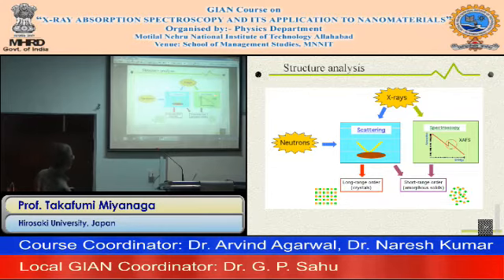On the other hand, in the case of X-ray absorption, I will show you more details later. The very short photoelectron mean free path is important, so short-range order is enough in the solid. So amorphous solids, liquid states, or nanoparticles are very effective for X-ray measurement. Neutrons are also used, by the neutron diffraction method as a process of neutron scattering.